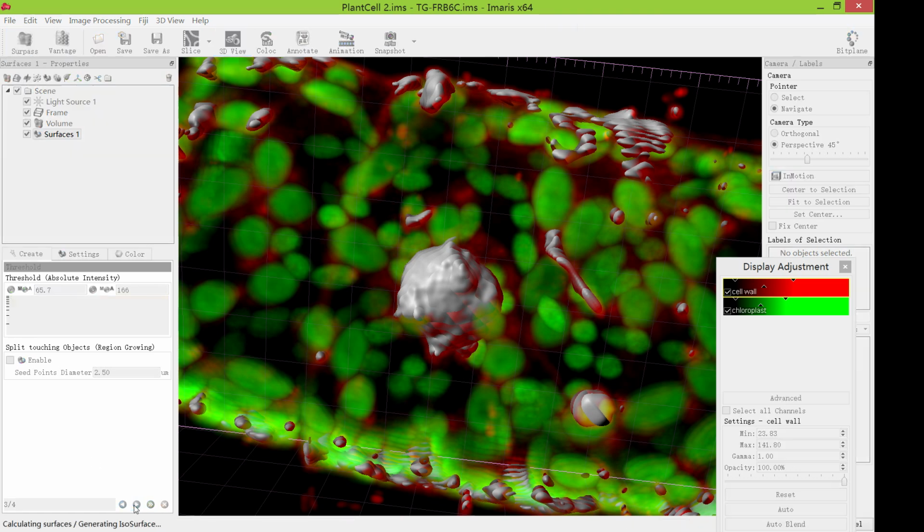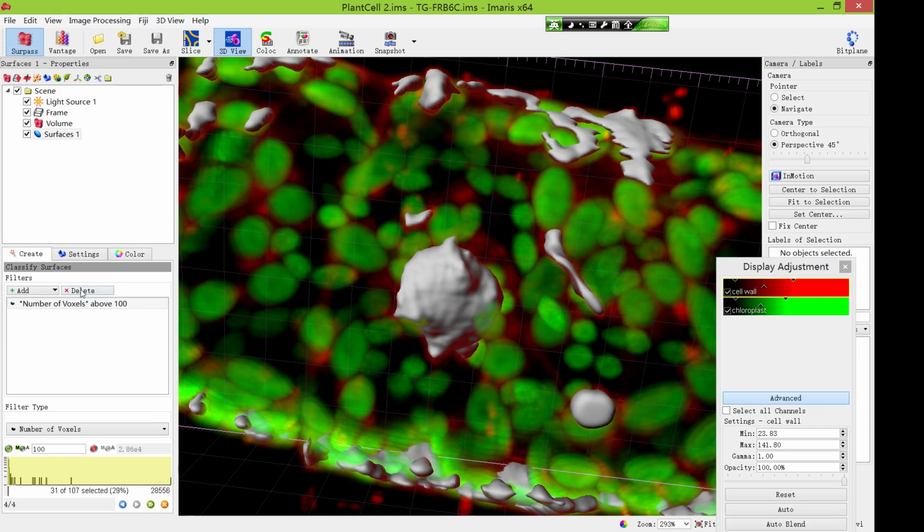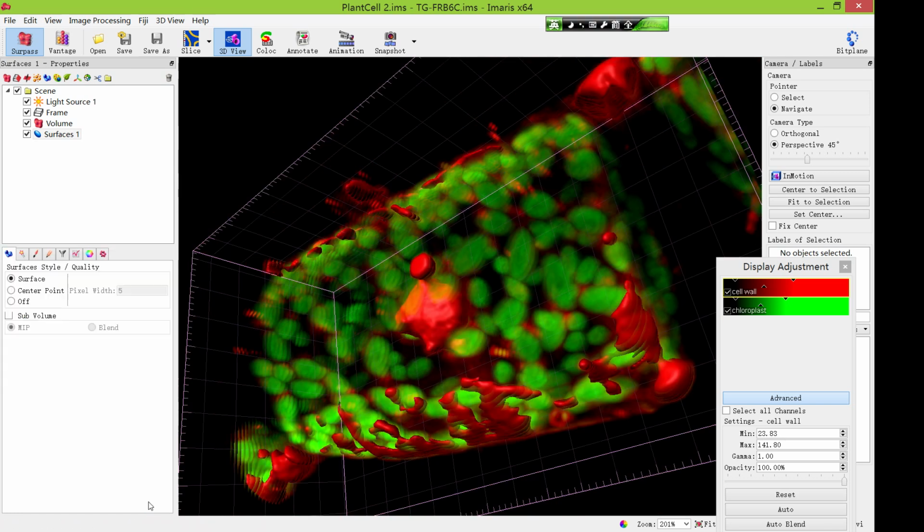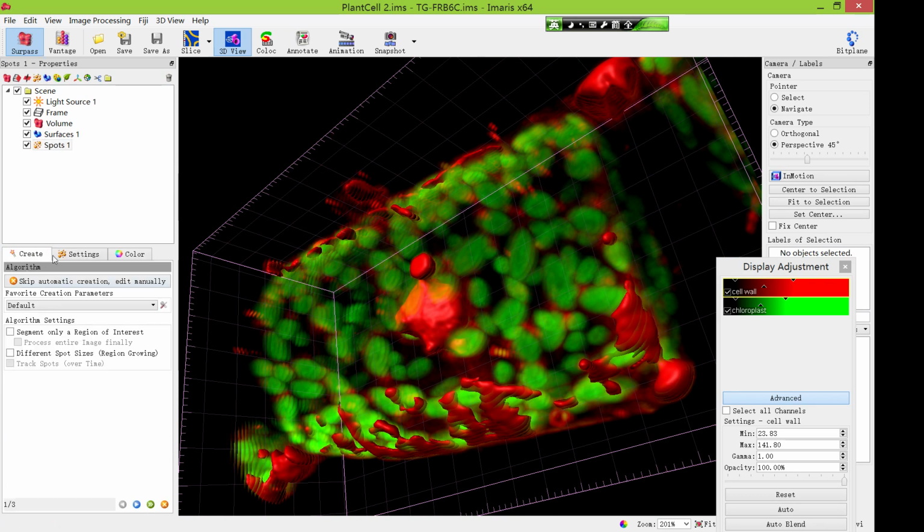This is the same, because usually we do not modify this step. So you can just click the green button to go all the way down. And for the DAPI it is the same. For DAPI, we click the experiment 1 nucleus we created, and it's the same. There is no tick for the background subtraction, and there is a 5 micrometer.